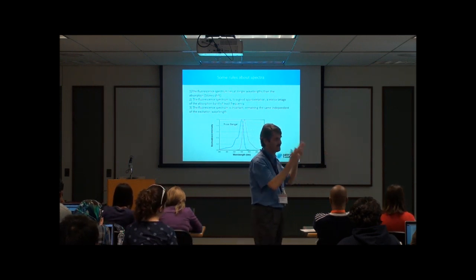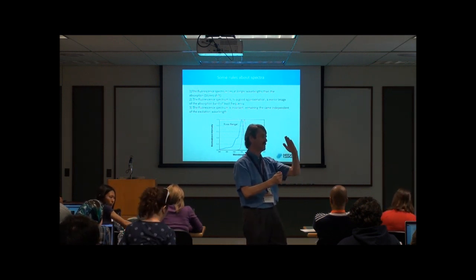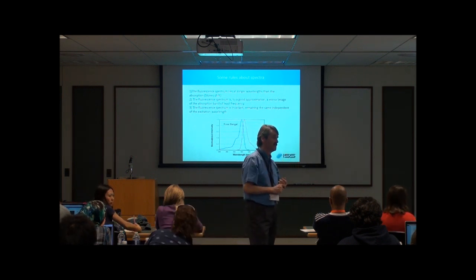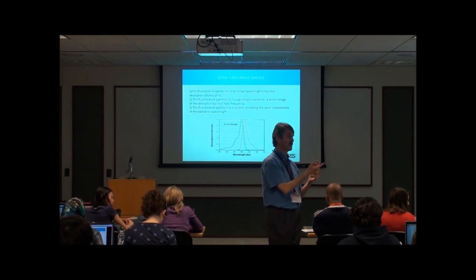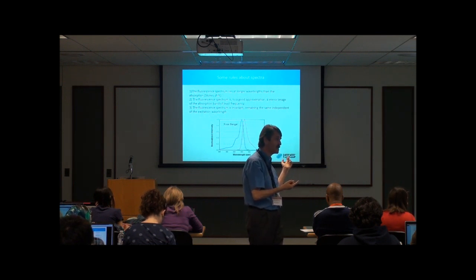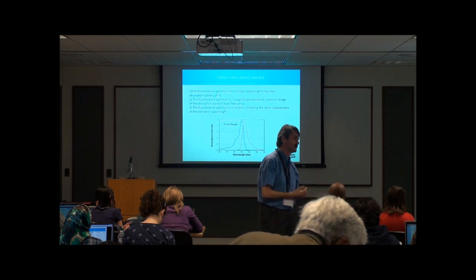This is, let's say, a fortunate case, anthracene, because of the symmetry of the molecule. But if we take tryptophan, the transition moment actually makes an angle. So you have to know quite a bit about the fluorophore that you're using in order to interpret these. Usually you don't know, and you can actually use these measurements to separate how the excited states work and infer something about the directions of the transition moments.